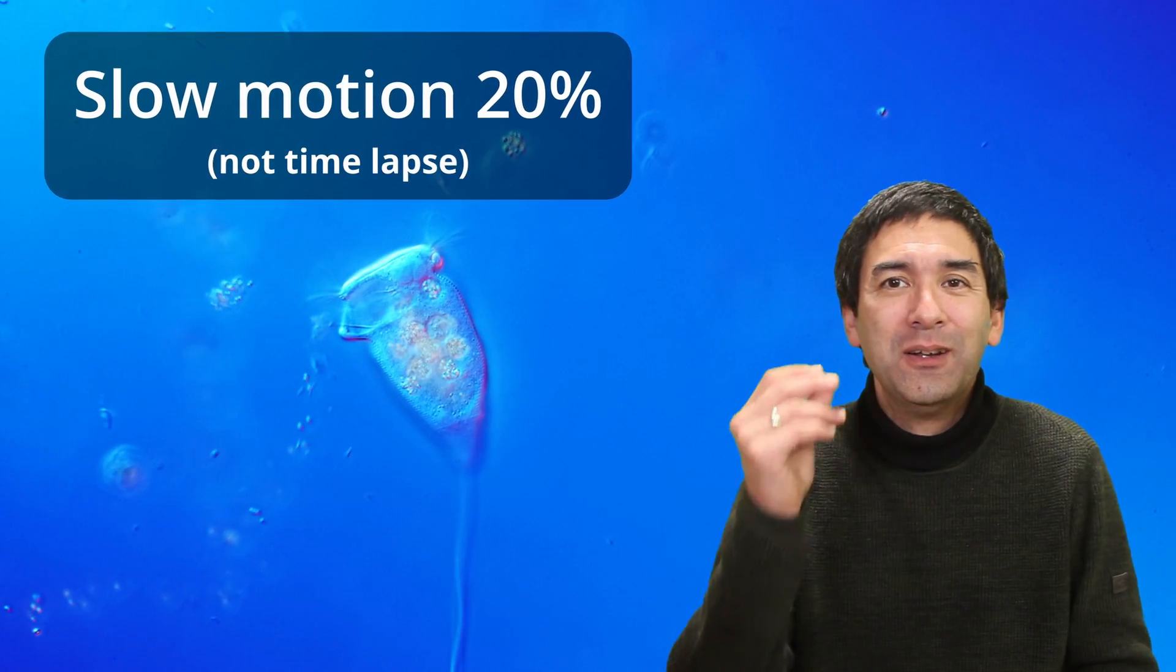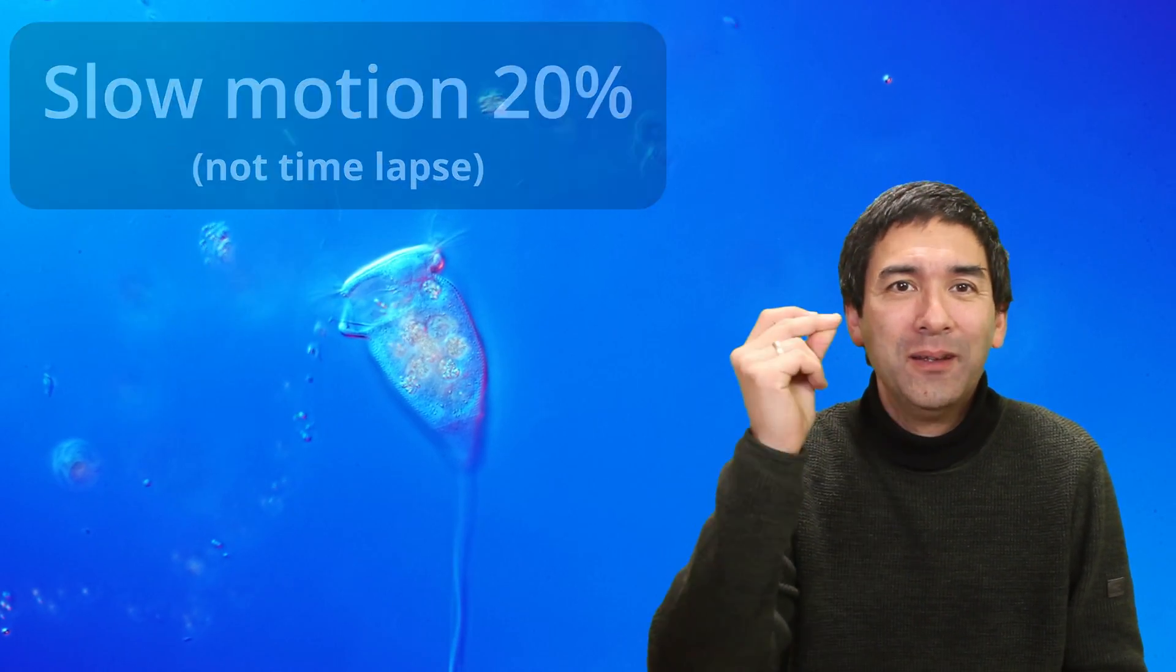Well, it's not some kind of video trick. Let's now have a look at the time-lapse. Three, two, one. Well, it's much faster than what my camera is able to resolve.